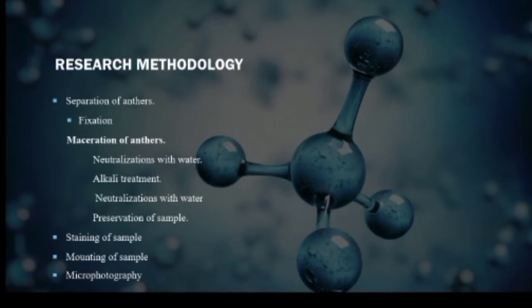The research methodology which was carried out included the separation of the anthers, and then the fixation was performed. Fixative contained the glacial acetic acid, ethanol, and formaldehyde. Maceration of the anthers was performed by carrying out the decantations in the centrifuge tubes, and the alkali treatment was carried out with the potassium hydroxide.